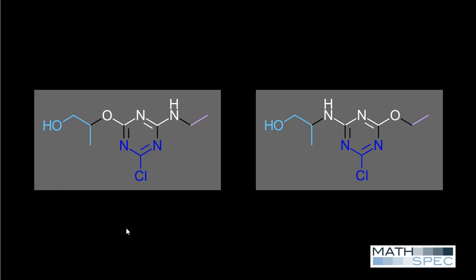Now these two are similar chemistry-wise because each one replaces the nitrogen atom that connects the alkyl side chains to the central ring system with an oxygen atom. So what's the likelihood that this change can be made? It appears that changing this atom should result in loss of the side chain.